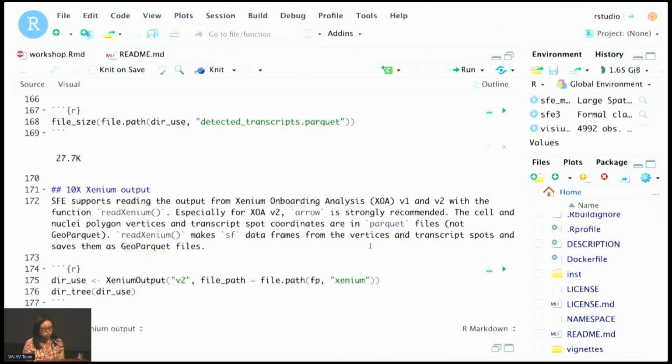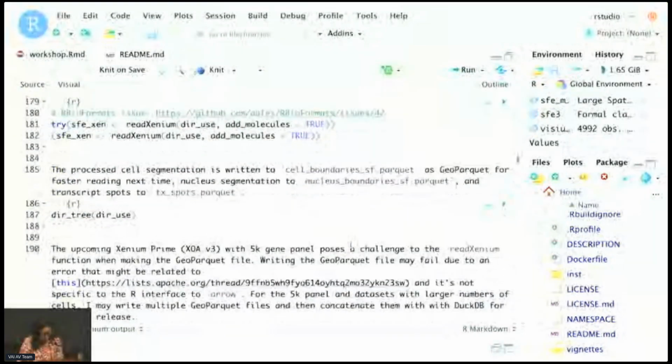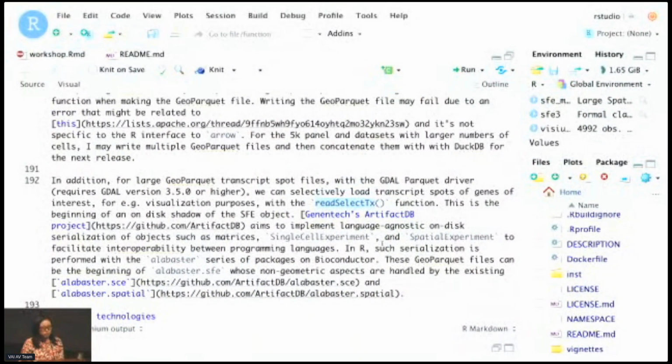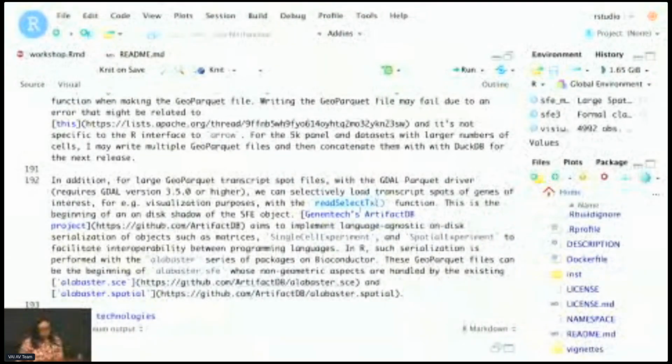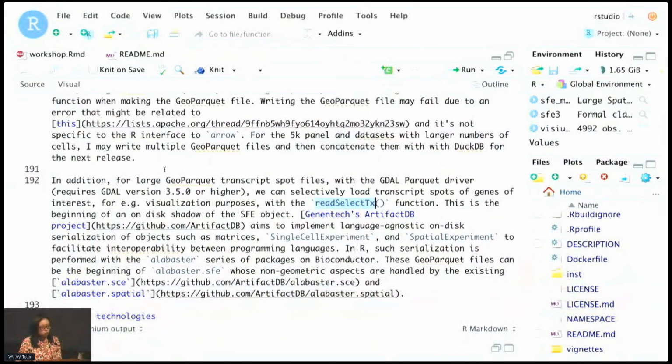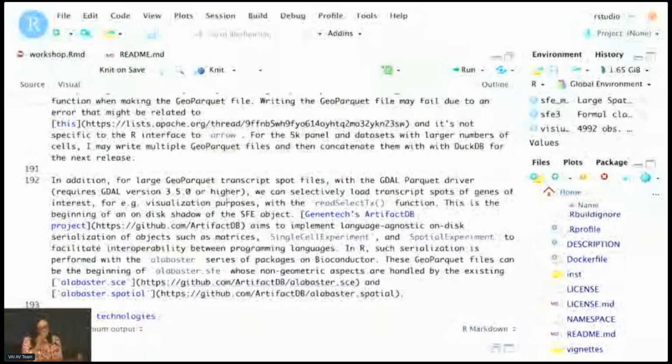That way, once you have the GeoParquet file for the transcript spots, you can use the function in the SFE package called read select transcript. Most of the time, the use case for the transcript spots will probably be visualization. With read select transcript, you can specify just a small number of genes, and GDAL behind the scenes will only read the transcript spots from those genes instead of everything. That's also called behind the scenes by the plotting functions that plot the transcript spots. But again, that requires a newer version of GDAL.